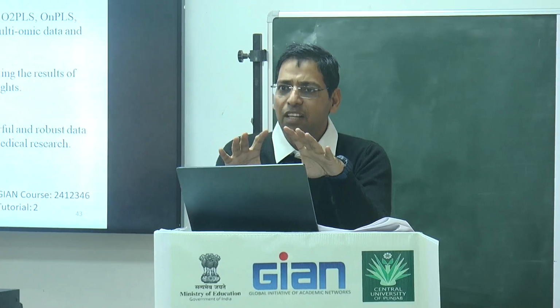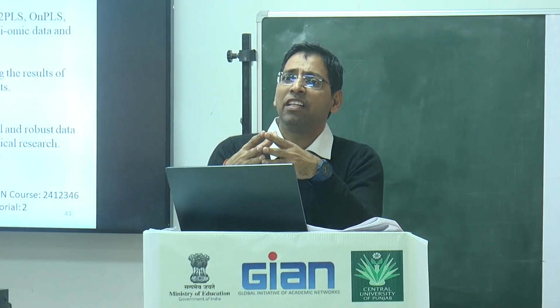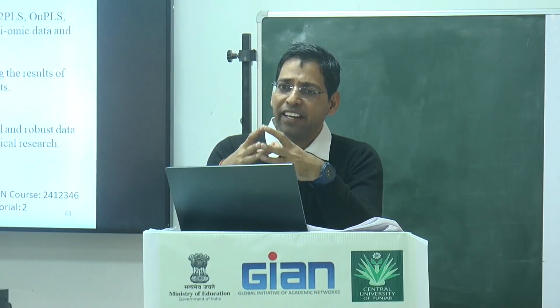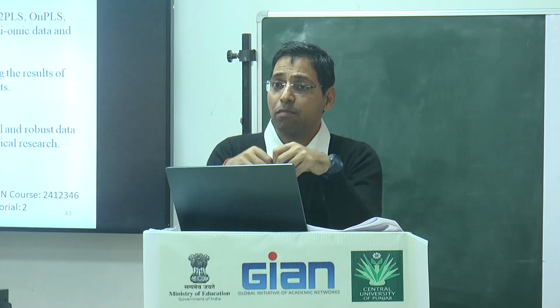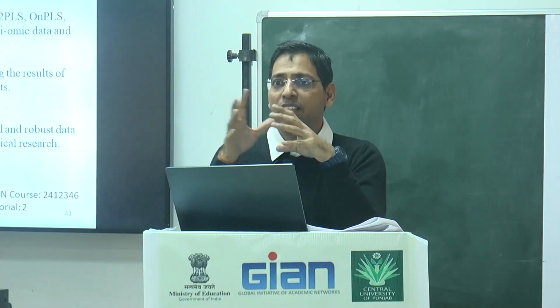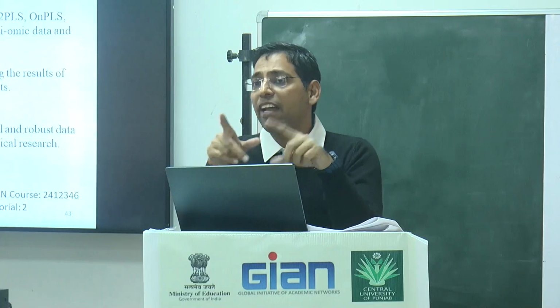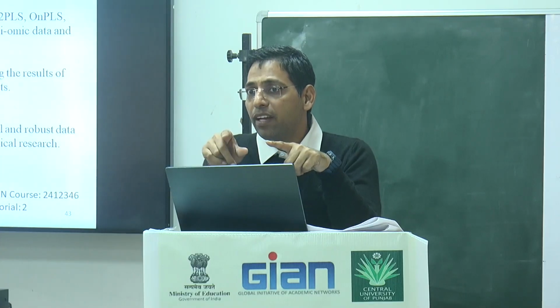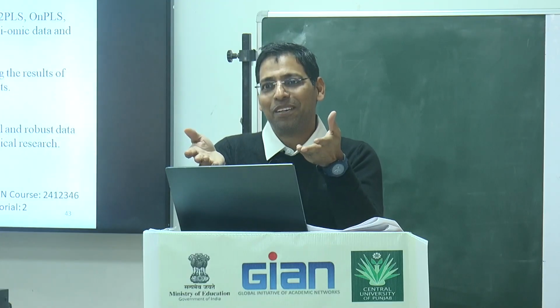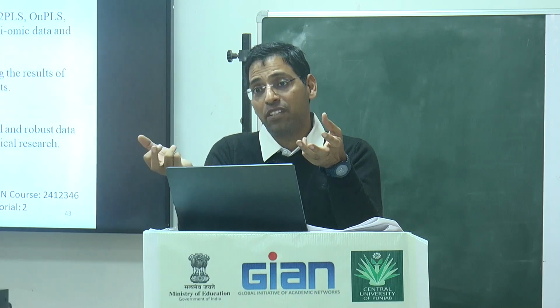So getting the peak is method development, and if your standard is not giving the peak, there is something wrong with your method. If you are getting the peak from your standards but not from your sample, some condition matters; some condition you are compromising. And if every condition is okay and you are still not getting the peak, maybe that analyte is not present in that sample. So try to understand, in the 3 different situations, there are 3 different observations.